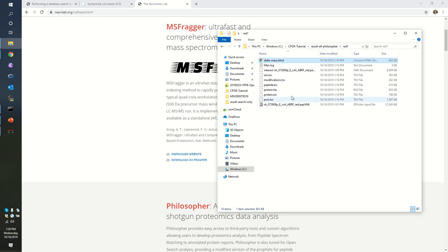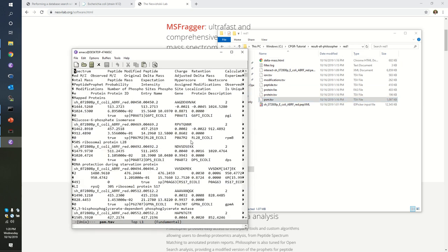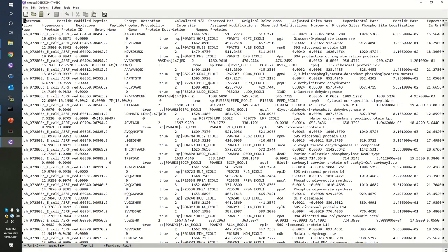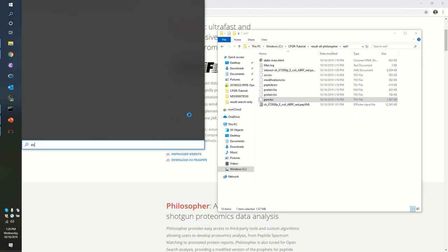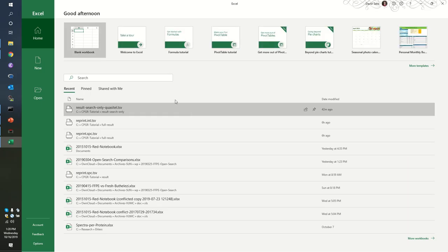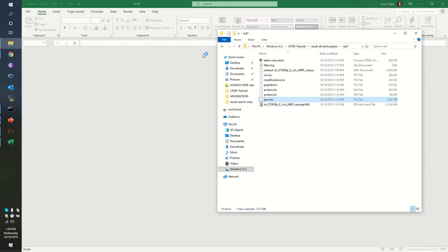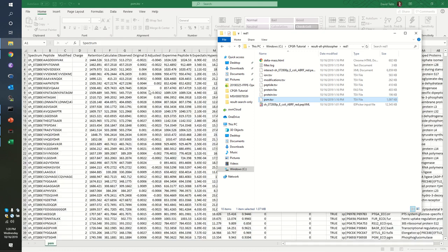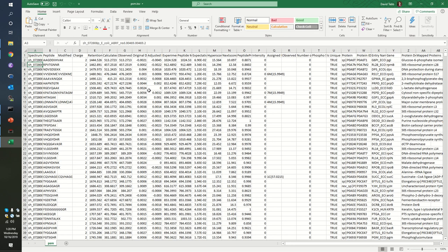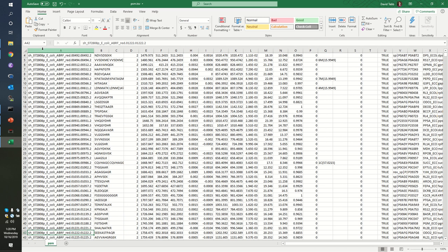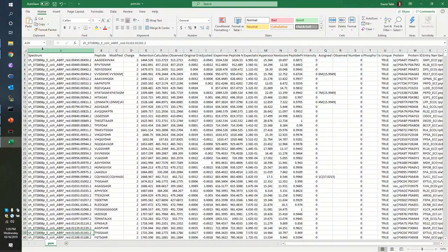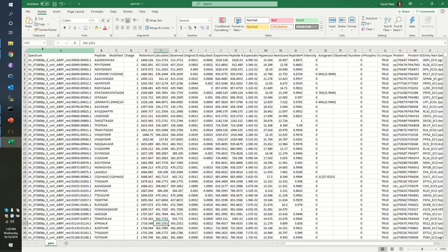Remember that we have a bunch of TSV files. These TSVs are tab-separated values. I'm going to open them in a text editor for just a moment. This is a PSM table. I'm going to open up Excel. We see that we have a whole bunch of spectrum identifiers at the left. Each of the spectra that was called identified has been given a different row in this table. We have peptide sequences, charge states, retention times in seconds, calculated mass-to-charge values and observed mass-to-charge values and the delta masses.